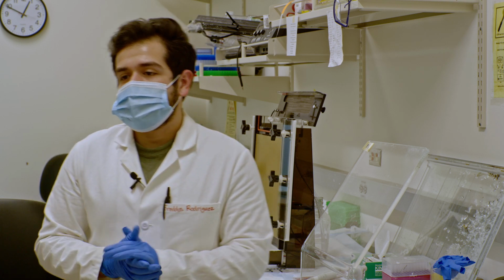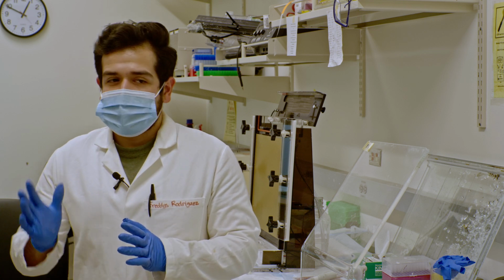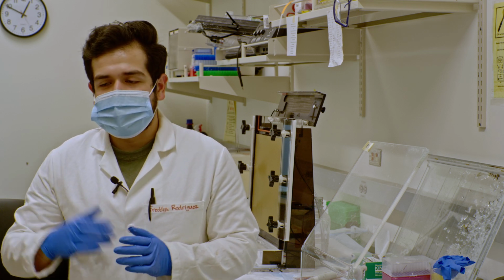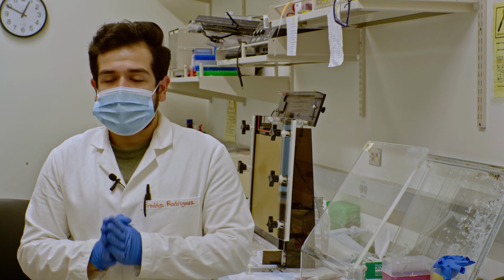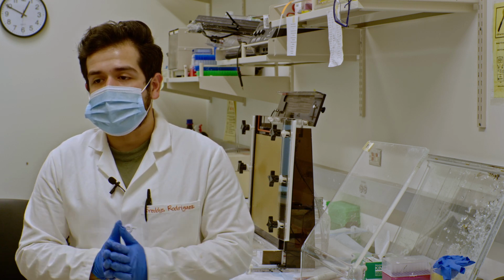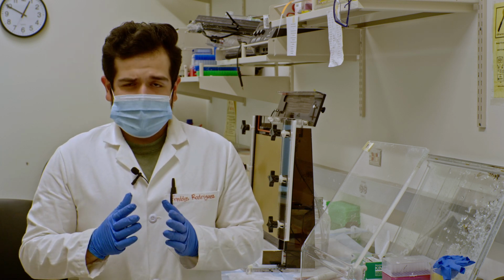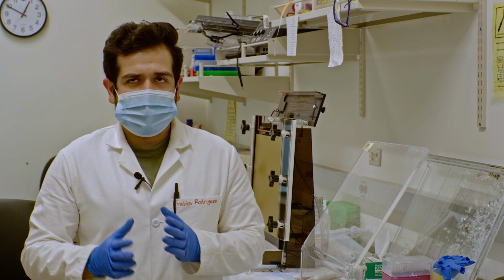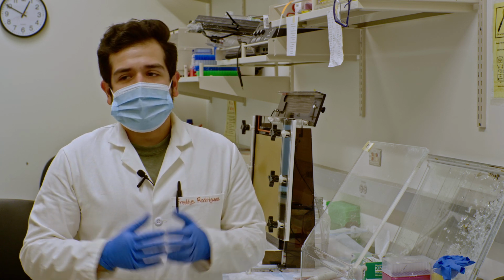So what do we do today? It's a 2-day process. A 3rd day if you include the imaging. But for the first day, what you want to do is radiolabel your primer that you're going to use and then anneal it to its template. Ideally, after you've set it up, you can use it a few hours after annealing, but in my experience, it's best to just prepare it and leave it overnight and come the next day and use your annealed template.